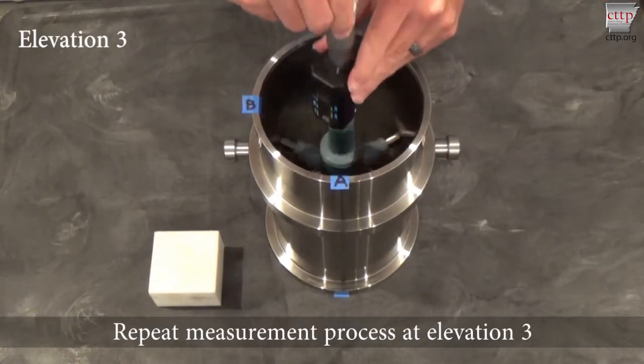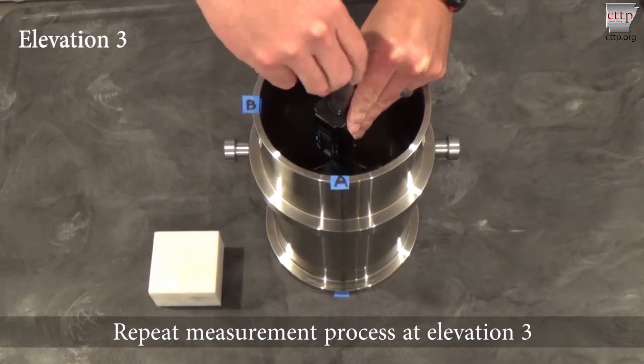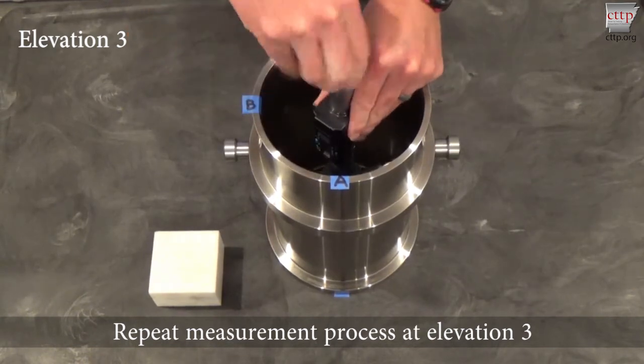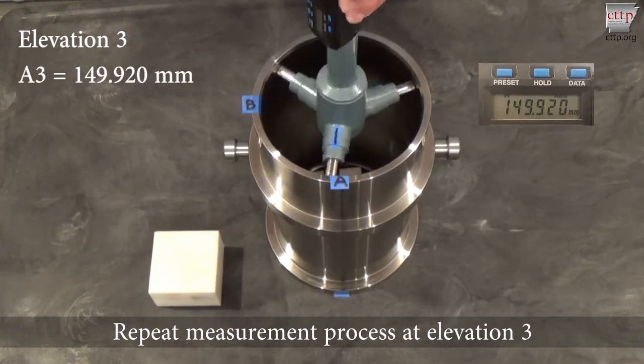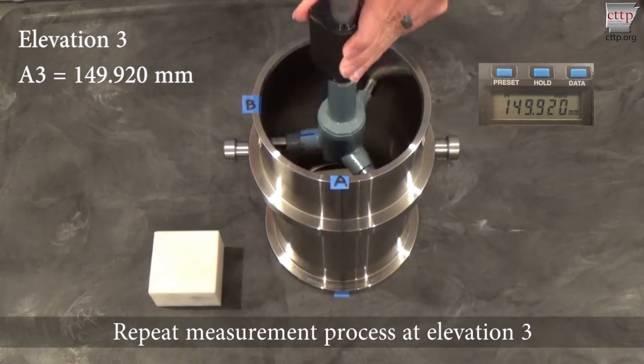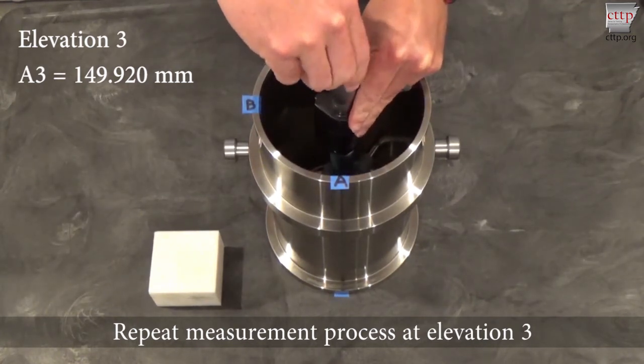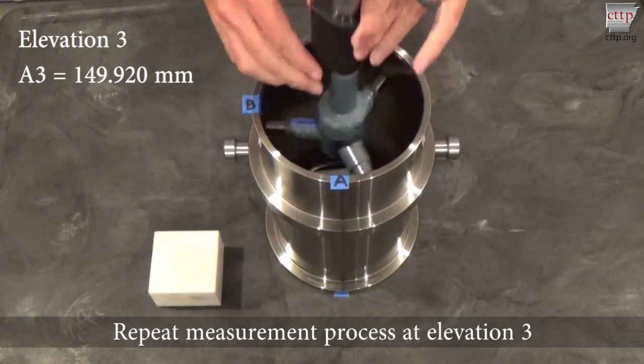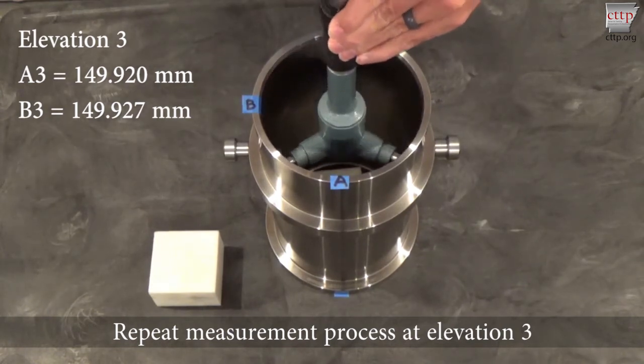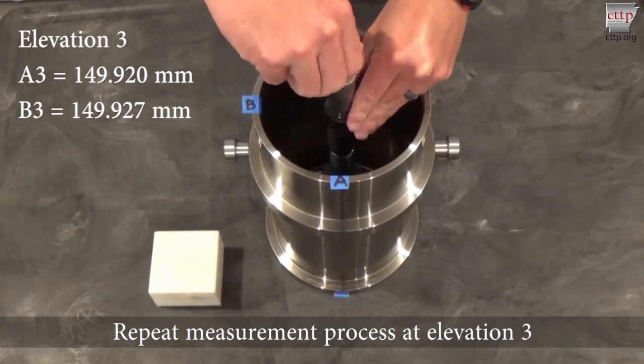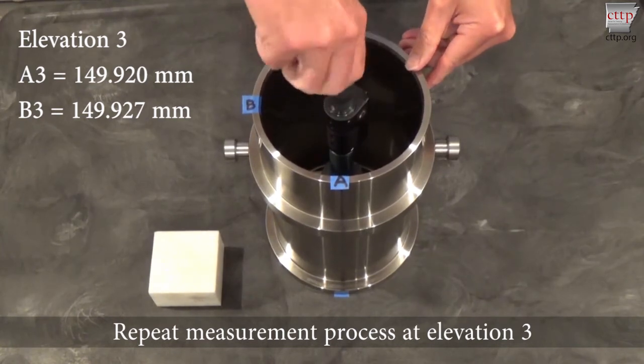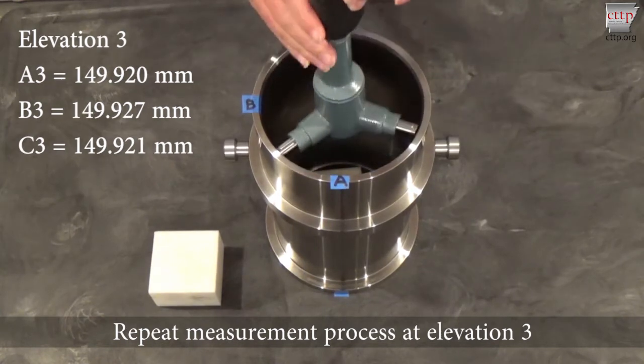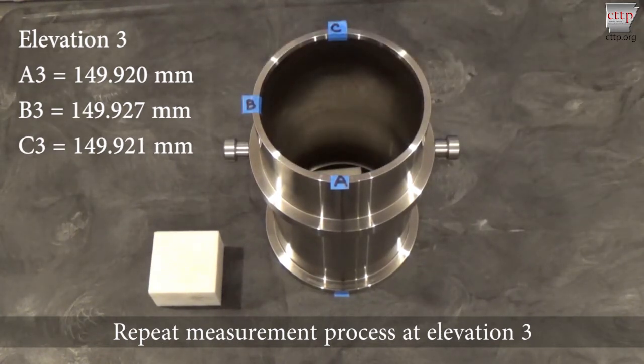Insert the bore gauge and repeat the measurement process at positions A, B, and C. Loosen and remove the bore gauge from the mold.